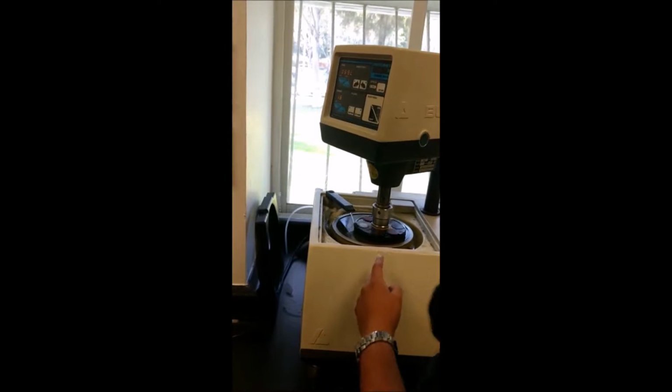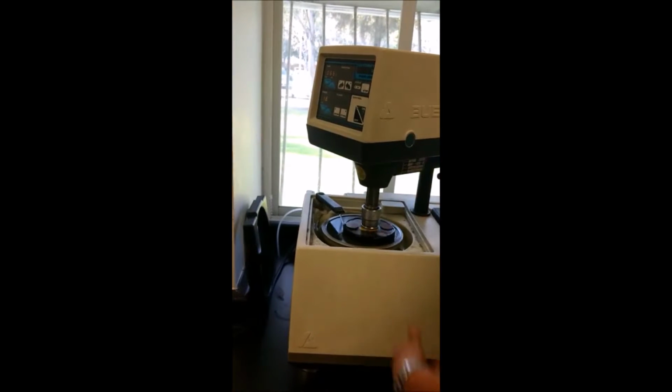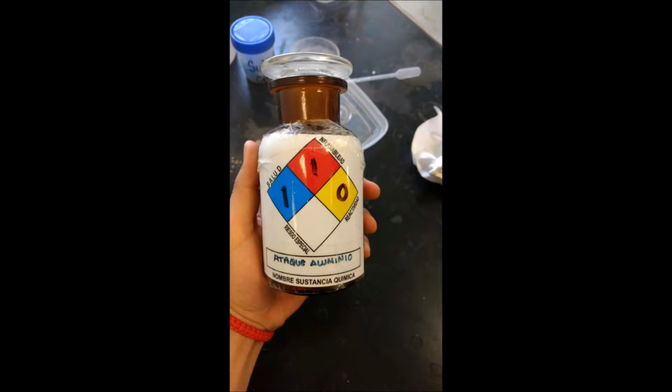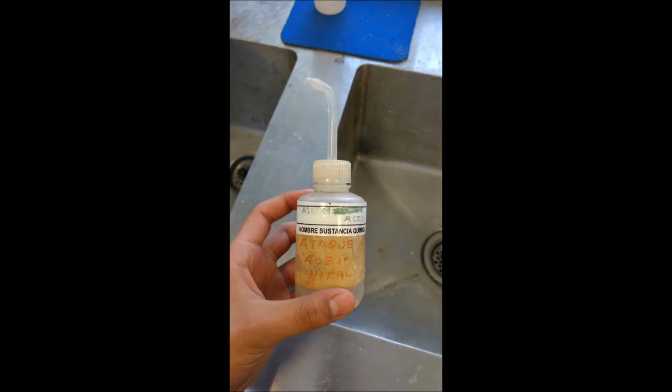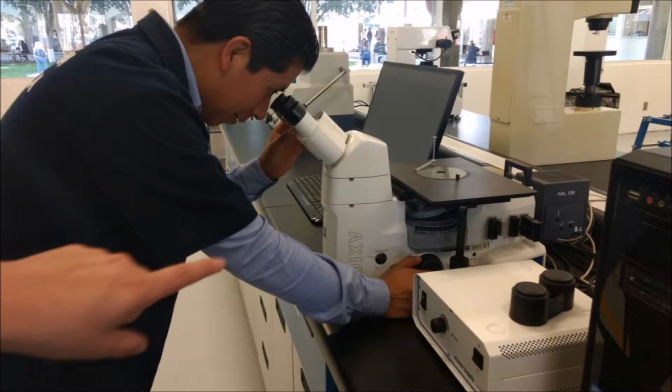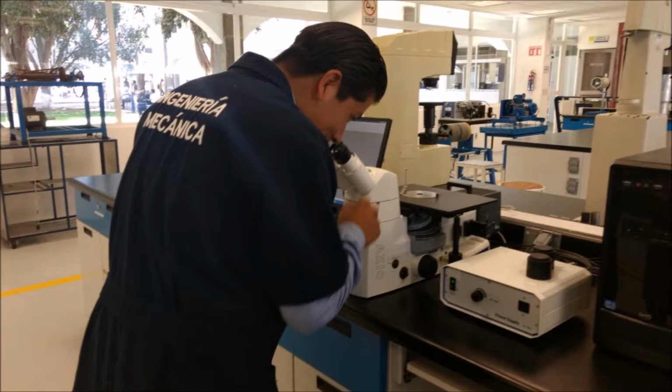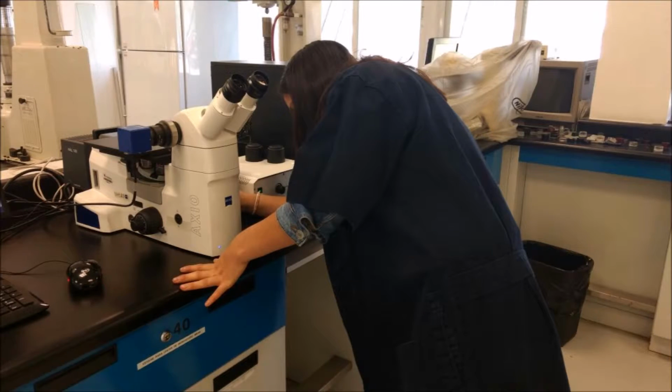Finally, we polished the pieces with microcloth to obtain a mirror effect. After that, with a chemical attack of nitric acid and hydrochloric acid for aluminum, and nitric acid and ethanol for steel, we were able to examine properly the microstructure by optical microscopy at 100x, 500x, and 1000x.